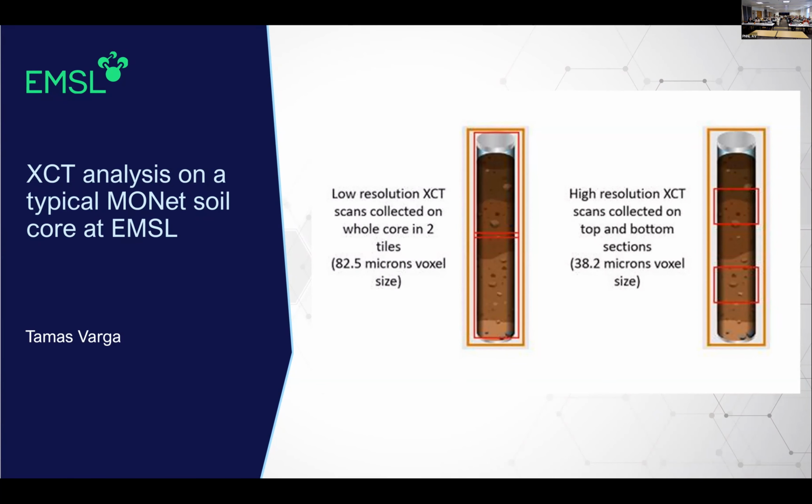this data. That's one more question I have, like the Shiny app that you already have, do you have variables from your pore scale analysis in the system right now so that you can see their relationship with the type of? Not right now, but I would love to have the pore scale data in there. Yeah. Actually, there are summary metrics in there. So yeah, there's pore connectivity, tortuosity, porosity, and some other summary metrics as well.